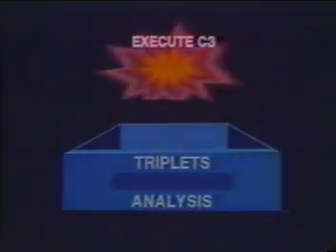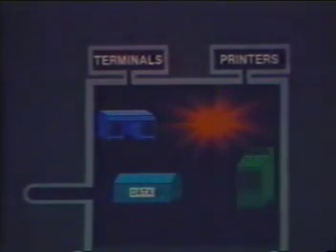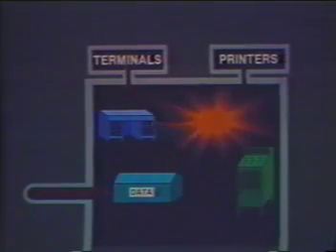Let's review what happens when the secretary receives the second Execute command for a sample. First, it transfers the label information onto an analysis card and places the card into the new analysis drawer. Then the secretary opens the FACS interface so that data will begin flowing. While the data is being collected, the warehouse informs the secretary of the warehouse address for each data point. The secretary, in turn, keeps a record of these computer memory addresses on the new analysis card. When the correct number of data points have been stored for a sample, the secretary closes the FACS interface.